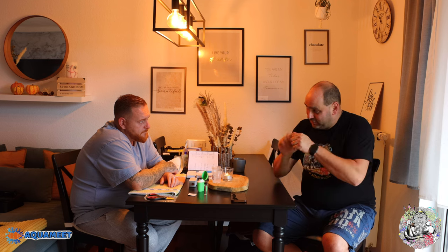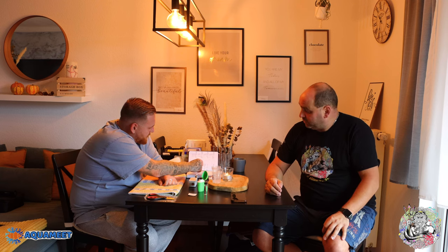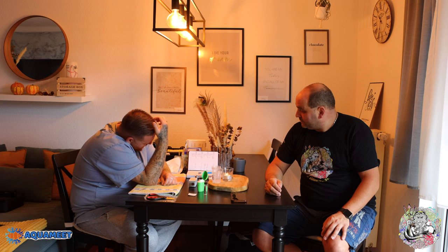Das Problem ist: wenn man nur mit einer Küvette arbeitet, muss man ziemlich zügig arbeiten, weil das Gerät sich nach ca. 30 bis 40 Sekunden zwischen den Proben abschaltet. In der Zeit muss man das Pulver hinzugeben, mischen und die Küvette sauber machen – was dazu führen kann, dass das Gerät sich abschaltet und die Messung hinfällig ist. Von daher arbeite ich grundsätzlich immer mit zwei Küvetten. Aufgrund des gestrigen Messergebnisses von 0,08 haben wir nicht dosiert. Da sind wir mal gespannt, wo wir heute liegen.